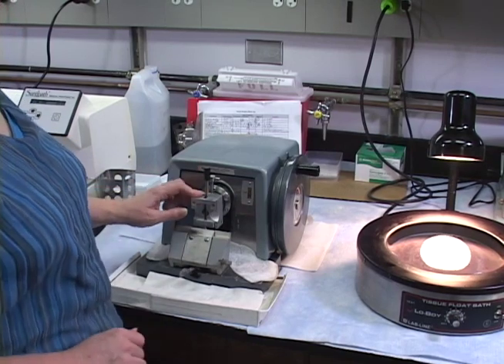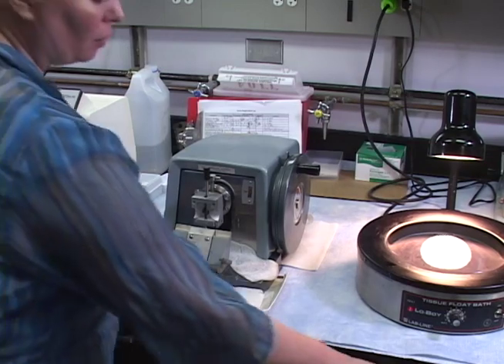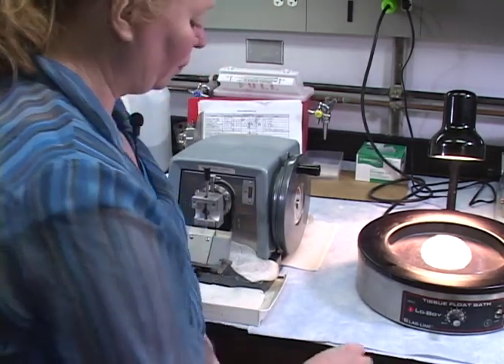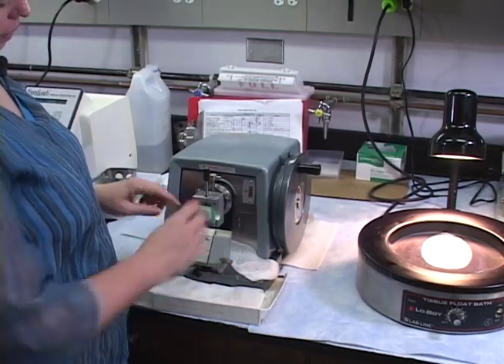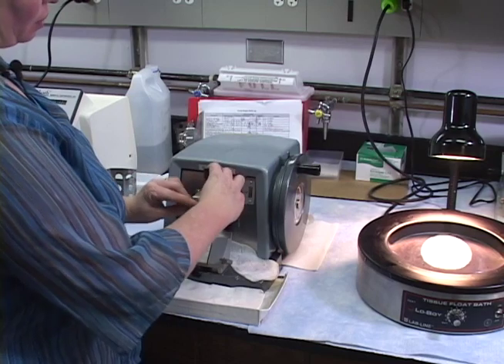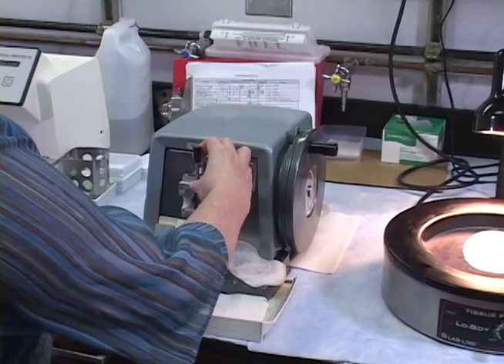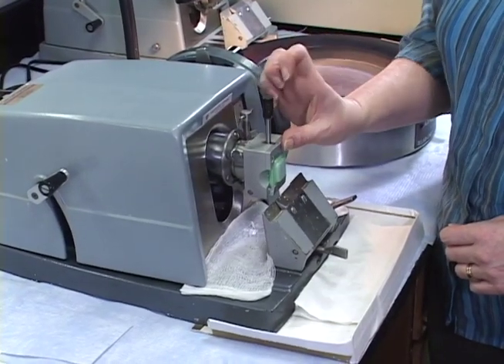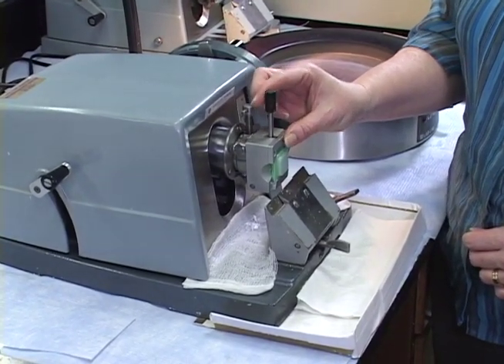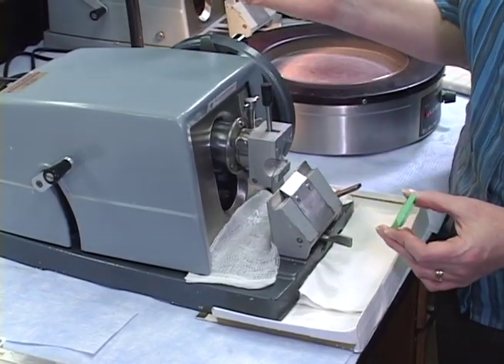This is called the chuck holder. Our chuck holder will hold our blocks only in one of 2 ways. It'll hold it this way, or you can flip the block around this way. So you leverage the chuck holder with your thumb here, and you pull it with your fingers here. And then you can put the block in. So you leverage it with your thumb here, and you pull it with 1 or 2 fingers forward, and you can remove it and release.